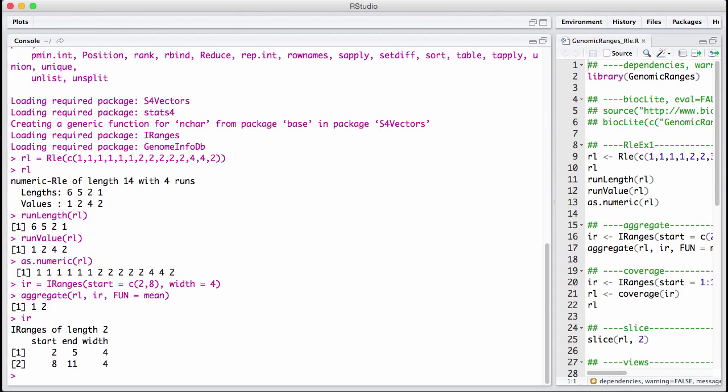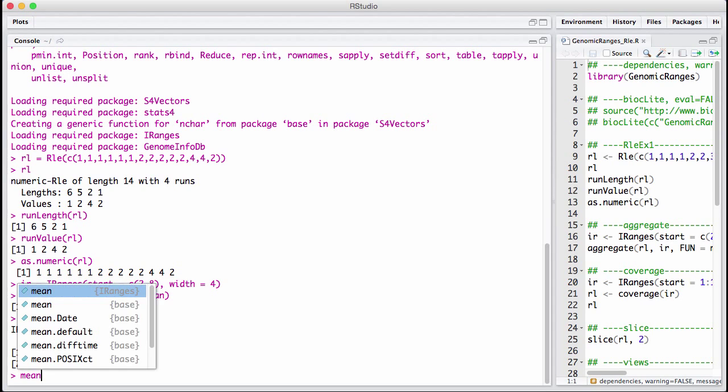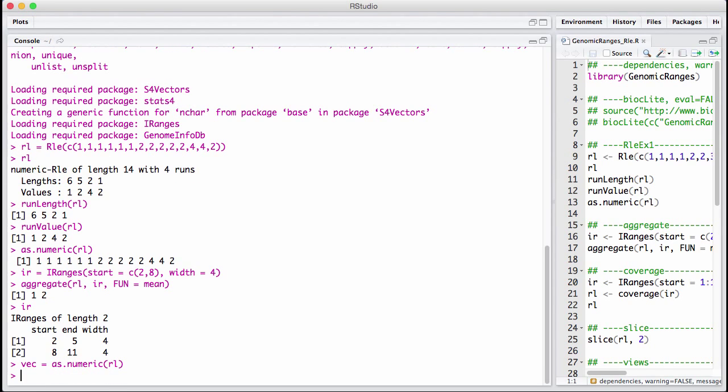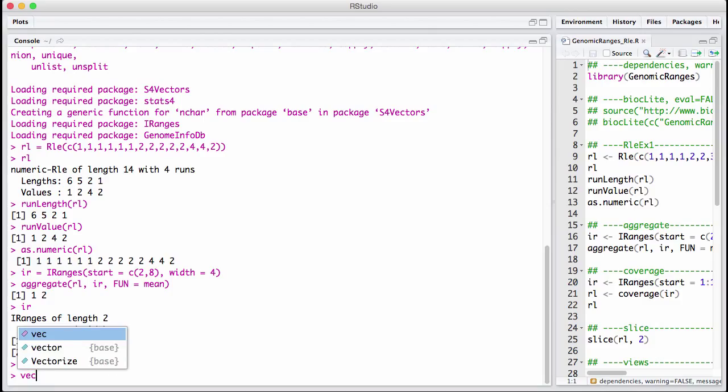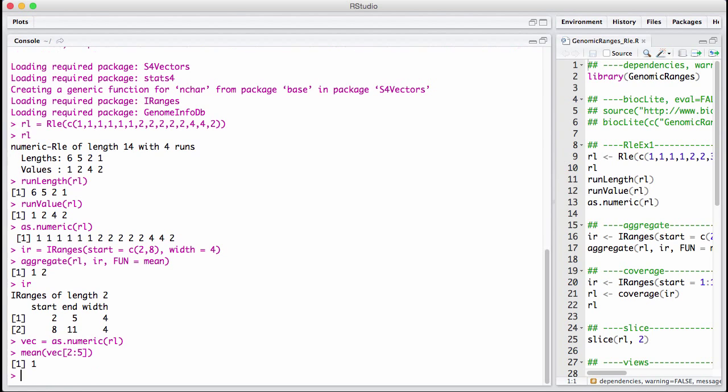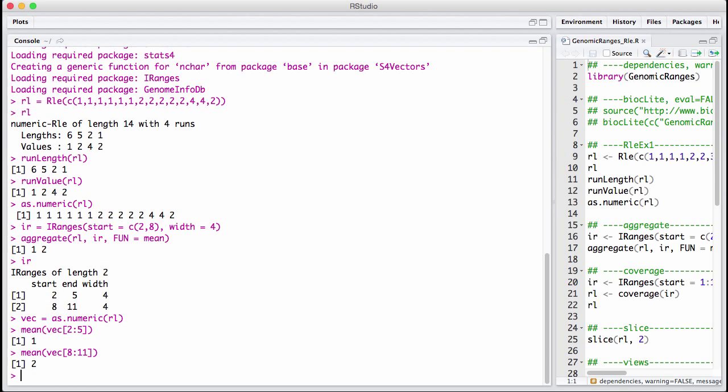And this is the mean of all the elements that are in the two different ranges. So it's the mean of our original vector. We got that by saying as numeric of isle. And we take the mean of vector 2 to 5, index by 2 to 5, mean of that, and from 8 to 11. So this could, for example, compute average signal across a set of pre-specified genomic regions of a coverage vector.